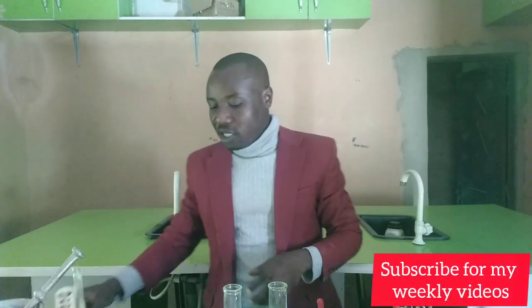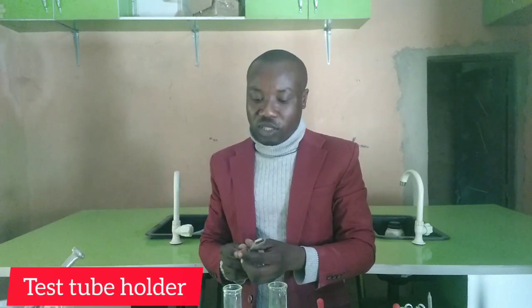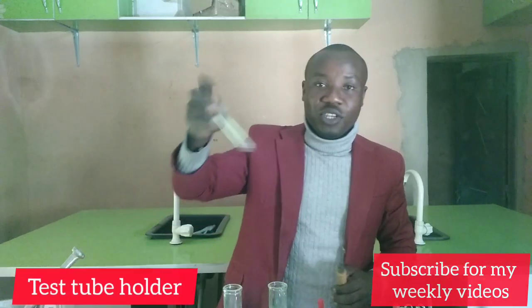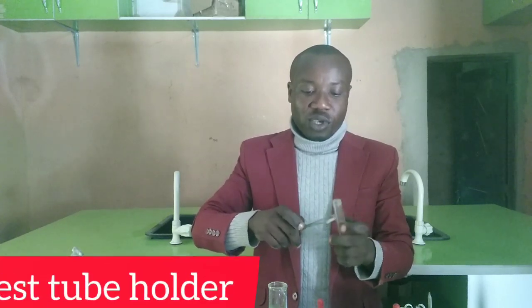Another thing we have is a test tube holder. If I want to heat something, I can use this for holding my test tube, because it would be very bad holding your test tube over fire like this. The holder will be convenient for you. It is not scientific to hold it by hand.